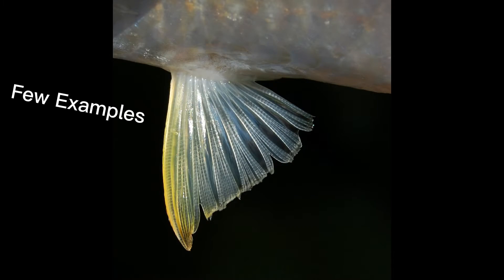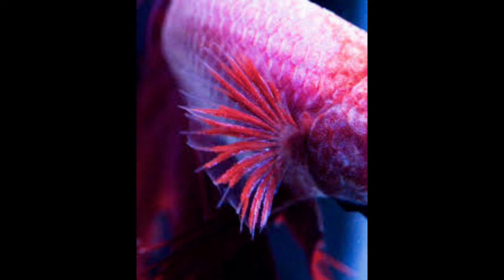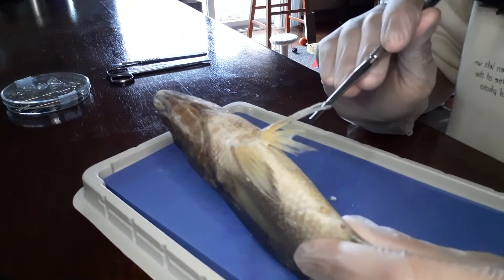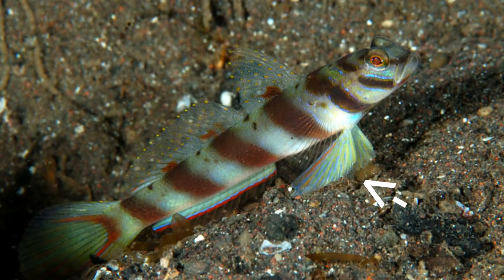The pectoral fin's function is very similar to a human hand. Here is the pelvic fin — it helps balance the fish underwater. The pelvic fin is similar to human feet.